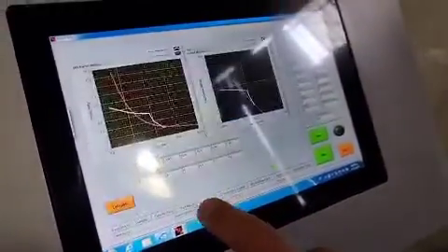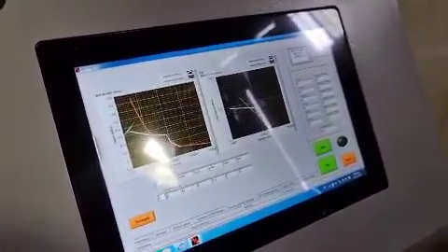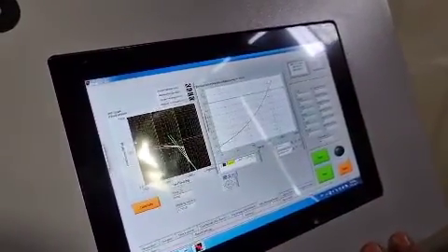When you choose the DVS norm, you will have three pages for tests of samples. The first page is for parent material testing, the second page shows test results for welded samples, and the third page is for welding factor calculation.